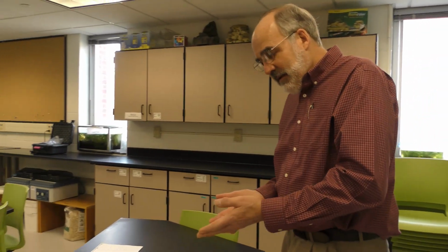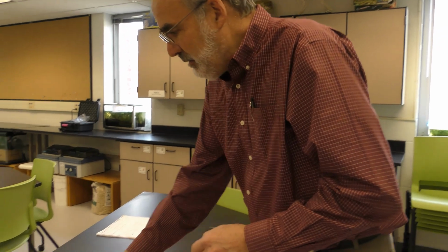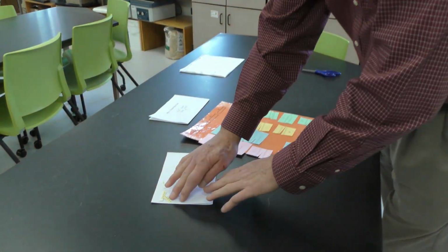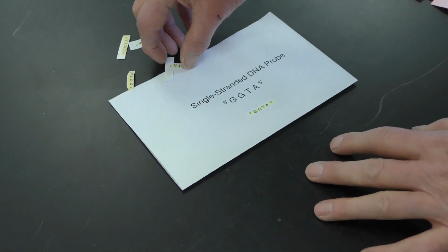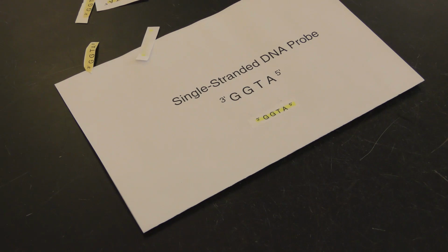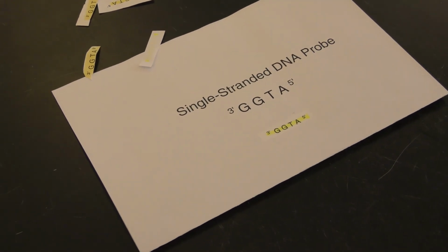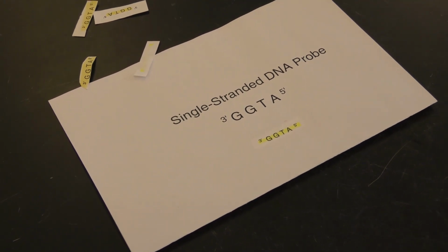And the only way you're going to see these fragments, we're not going to stain them with any kind of visible dye. We're going to use a single-stranded probe, okay? And this is the single-stranded probe that we created here. Now, a single-stranded probe is created in the lab, and you can see it only has 4 bases, GGTA, in the 3' to 5' orientation.